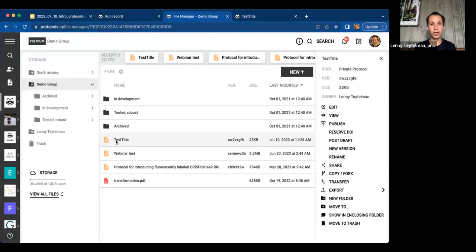So there's our test protocol. And the difference between this and the PDF is if you have many protocols and folders and subfolders, this is searchable with the keywords, the title, abstract that you put in. So when you come back in 3 months, or if you have multiple workspaces that you're part of, taking that extra minute or two per protocol, per existing protocol, to add the attachment to it, makes it much easier to retrieve and find, so they become much more discoverable within the workspace.